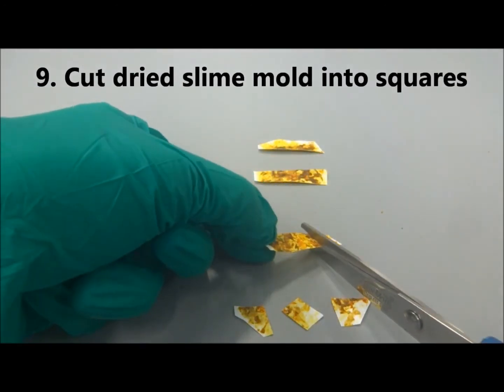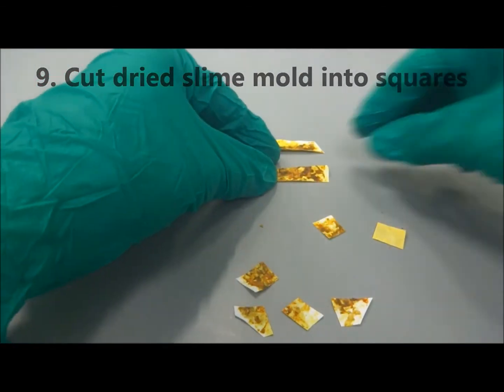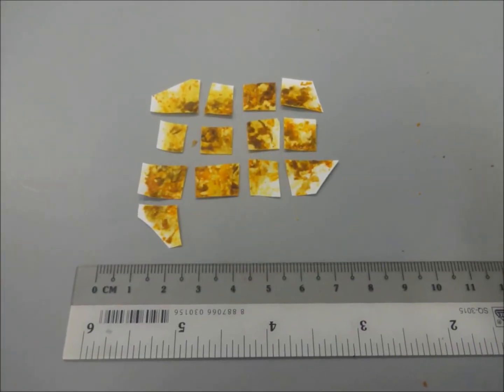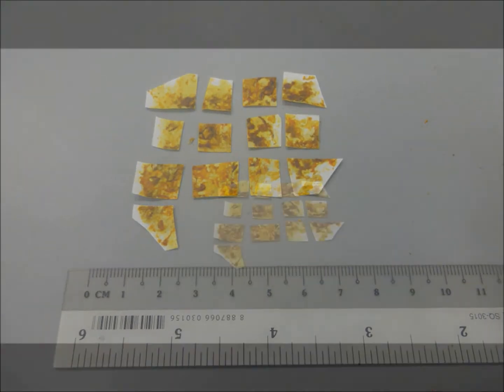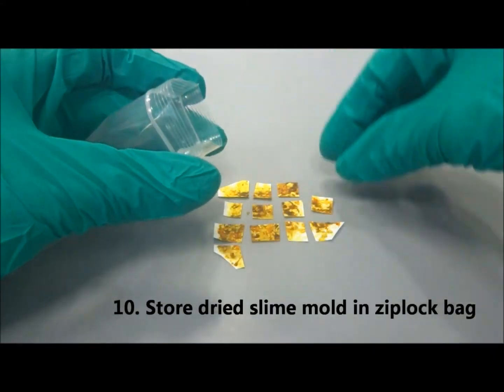Ensure that the dried slime mold is not exposed to moisture at this stage. It will return to the actively growing Plasmodium stage when exposed to moisture. Seal the dried slime mold in a plastic bag.